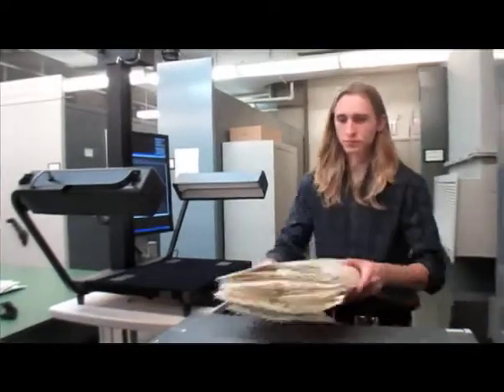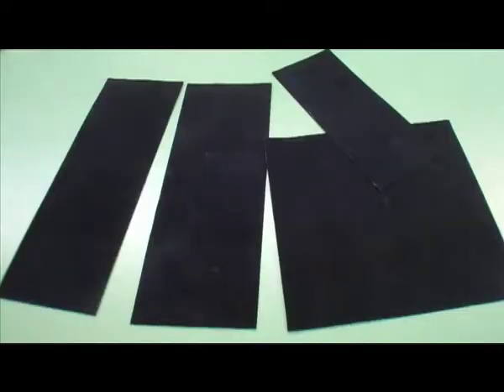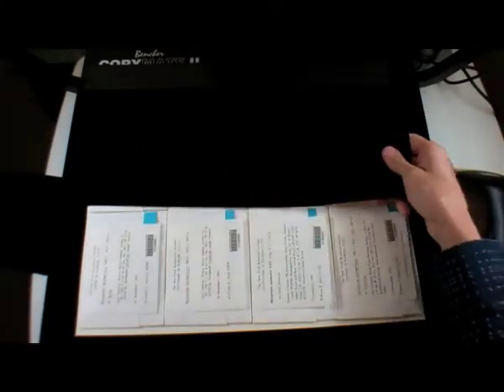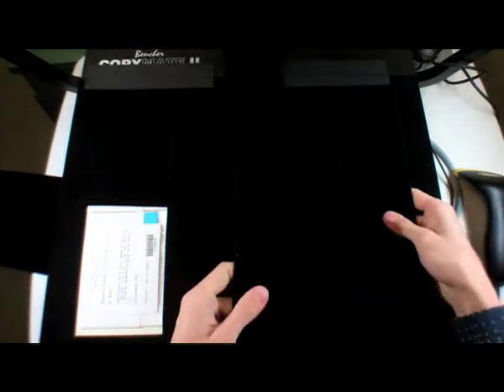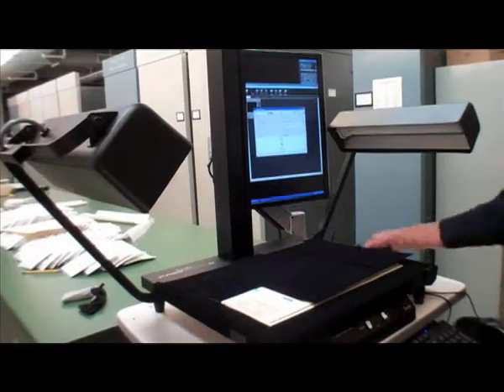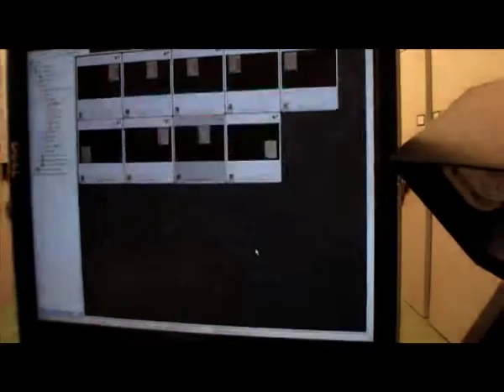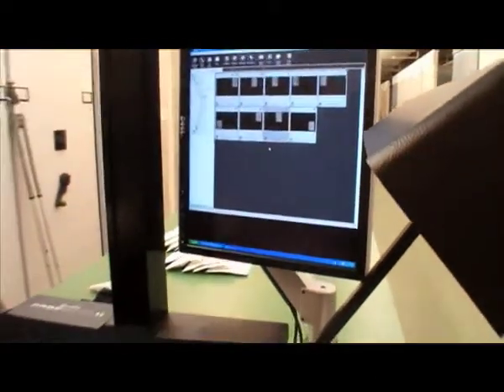Herbarium sheets containing target specimens, previously marked with conspicuously colored annotation labels, are positioned on the horizontal stage in the center of the camera's view frame. Clean black felt, mounted on a portion of semi-rigid poster board, is used to cover up all but one target specimen packet at a time, and a single digital photograph is taken of the outside label. A barcode scanner is used to label each digital photo with a unique eight-digit barcode number assigned to the specimen it represents, and the image is saved in proprietary Canon RAW format, extension CR2, directly to the hard drive of the operating computer. The pieces of mounted black felt are rearranged as necessary as each subsequent specimen packet is photographed, scanned, and saved.